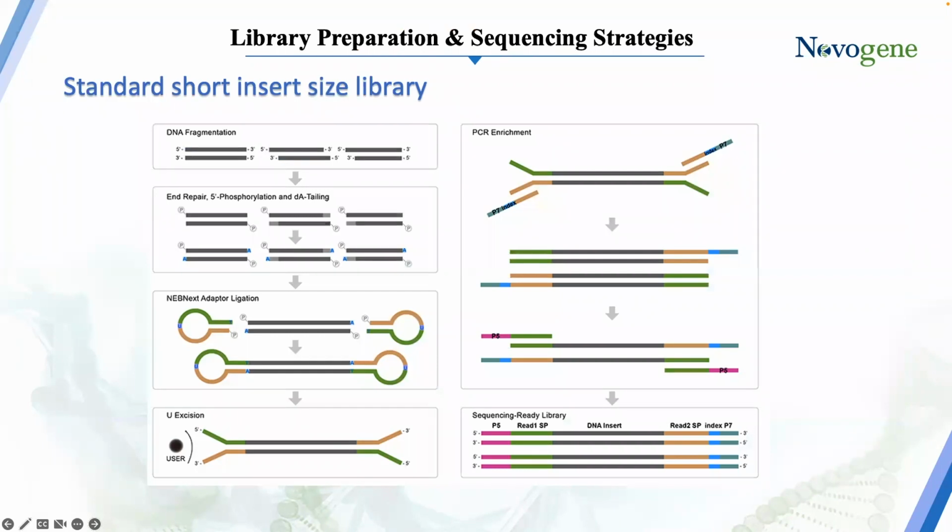So I mentioned the two different library preparations. The image on the slide here is the workflow for preparing a PCR Amplified Library. I'll go through a quick description of what this is. But on Charles's slides in the beginning, we showed the bridge amplification process that occurs on the NovaSeq lane, the flow cell of the Illumina platform.